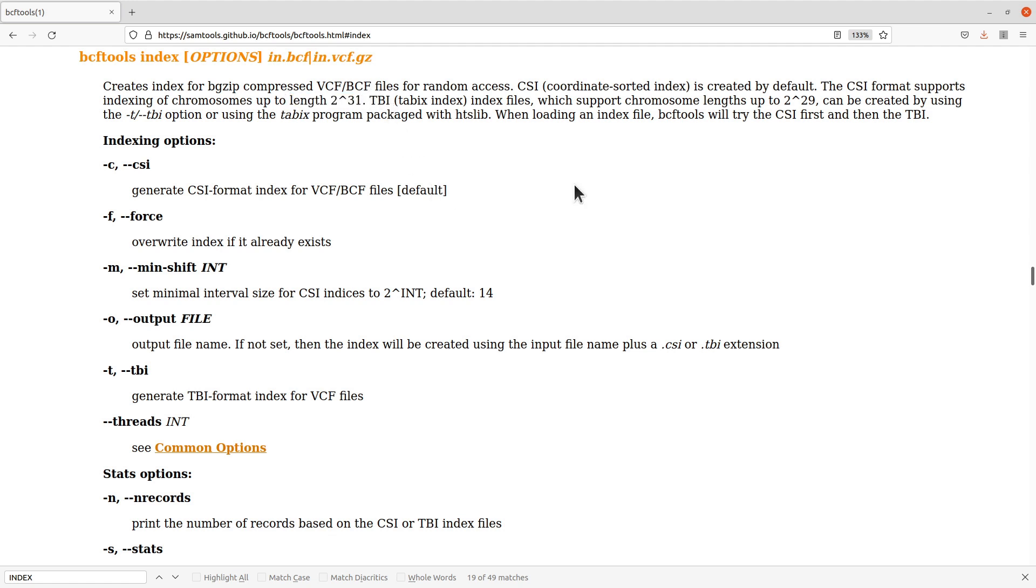We also have the TBI which supports chromosome lengths up to this one here. Depending on your VCF file and the contents, you just have to know which of these formats you have to use to do your work. Just know that information.